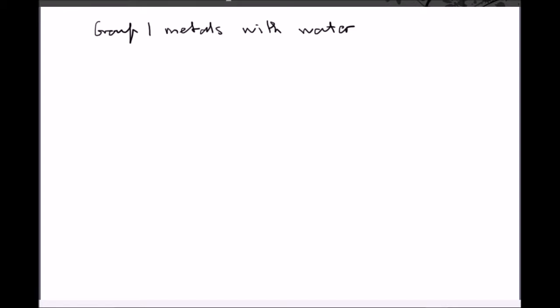Now, what we need to be able to do here today is, first of all, have a look at these reactions. Look at the observations. So what do we actually see that's going on in each of these reactions? Second thing then is we need to be able to explain these observations. So whatever we see, how can we explain that from a chemical standpoint?